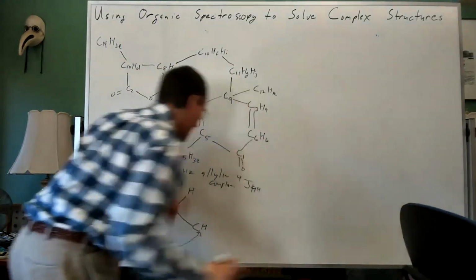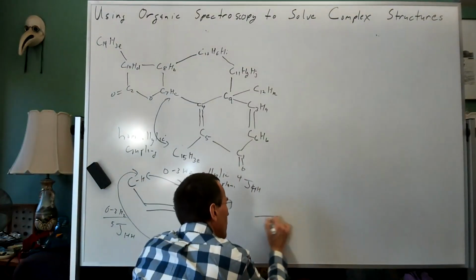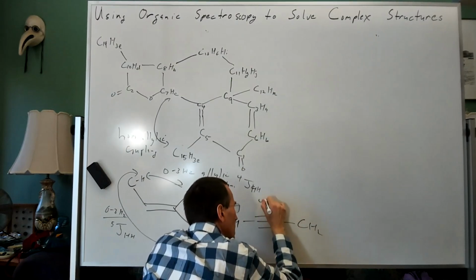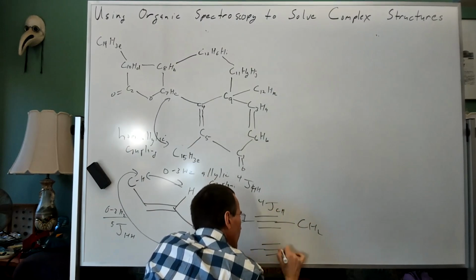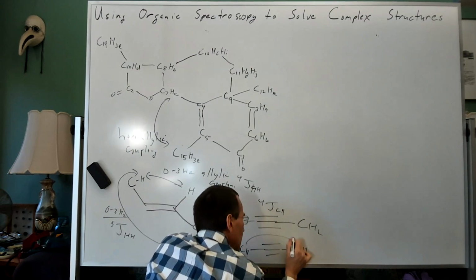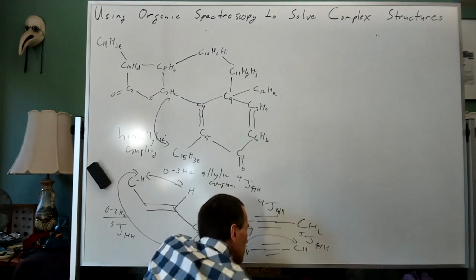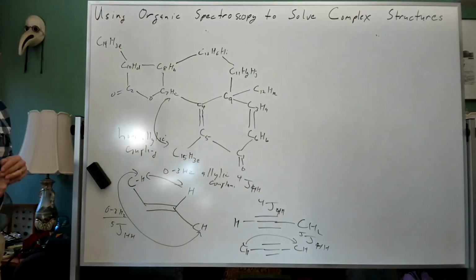So that's a J5HH. And we've seen the same thing in the homework in propargyl systems, where we've seen this, and this is also a J4CH. And I think we have even seen this, a J5HH. Why do I keep writing CH? HH. So yes, indeed we do have a long range coupling there.